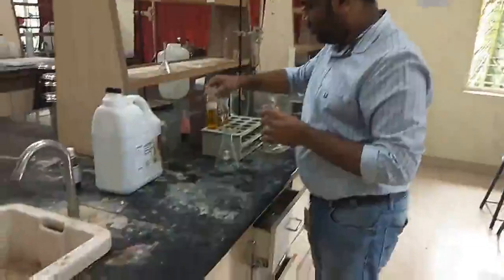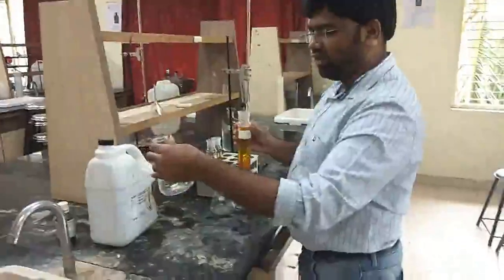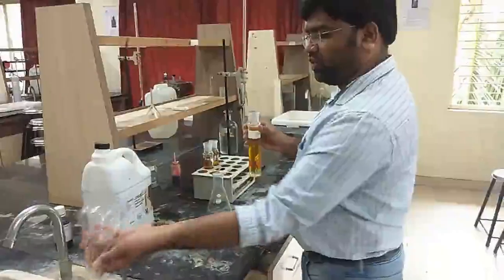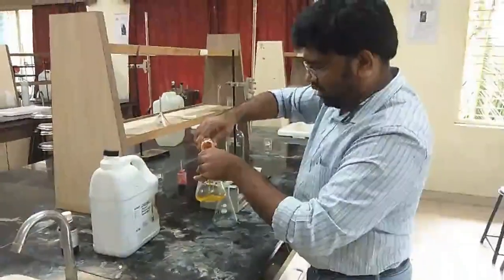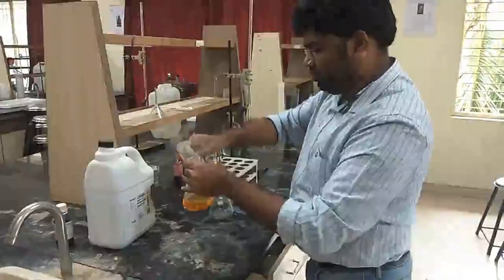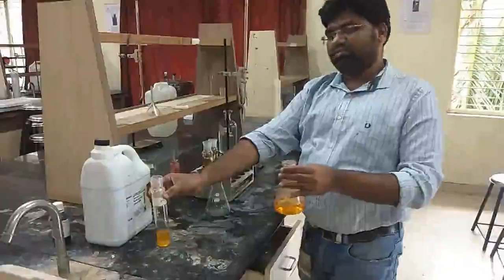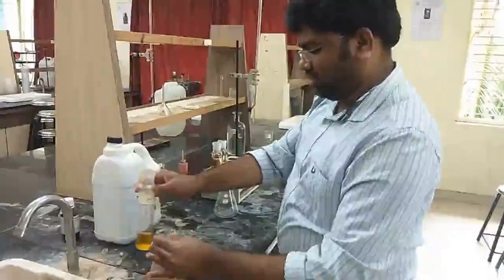Very properly you will be removing all the contents. You have to remember, because conical flasks do not have labels, which sample is which. So this is the blank sample that we are taking out. To be done a bit slowly.